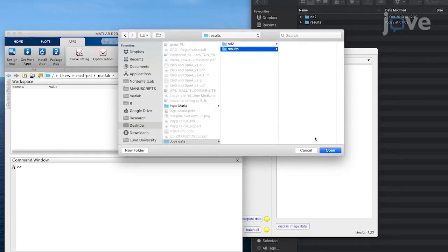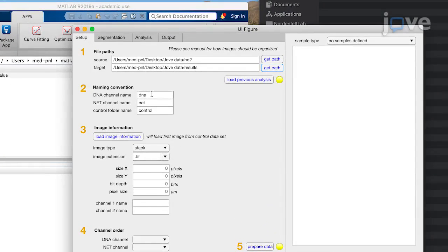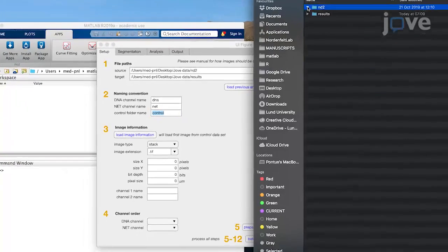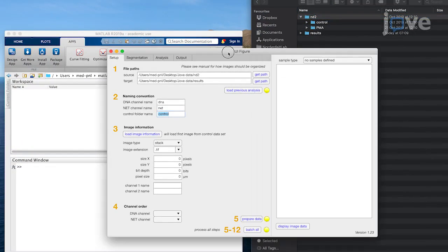When using separate channel images, name the channel folders so that the DNA channel corresponds with the nuclear DNA stain and the NET channel depicts the neutrophil elastase stain in the images. Also, name the folder containing the control image files as Control.